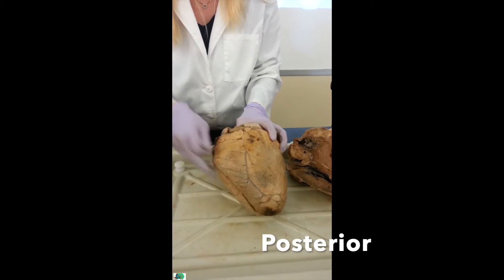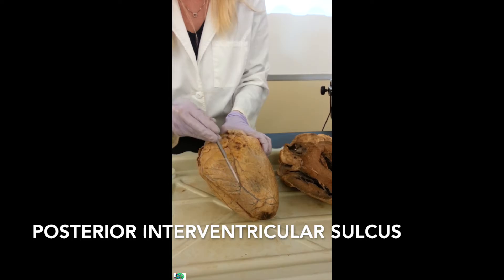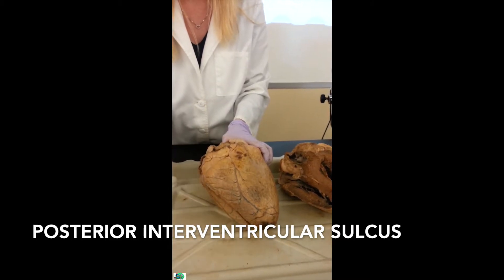For the posterior side, this sulcus is more vertical, and this is going to be the posterior interventricular sulcus, separating the right from the left. And there's my apex again.